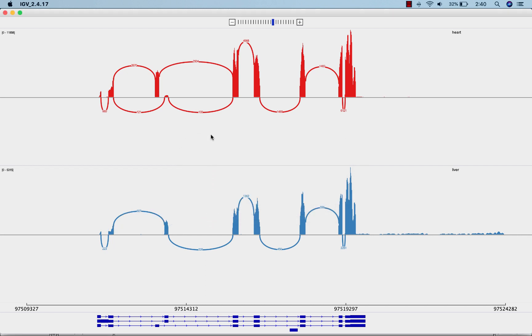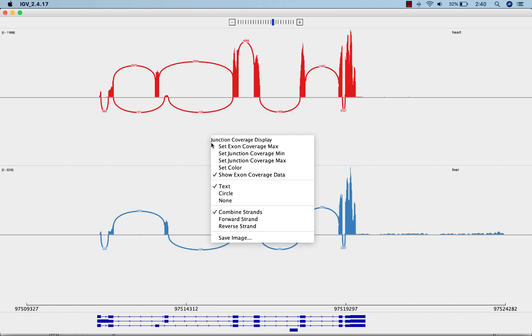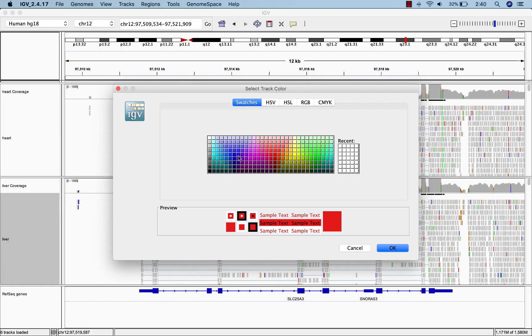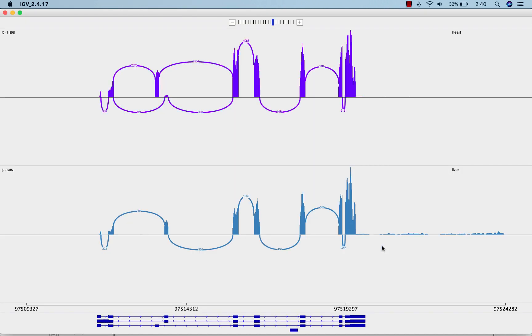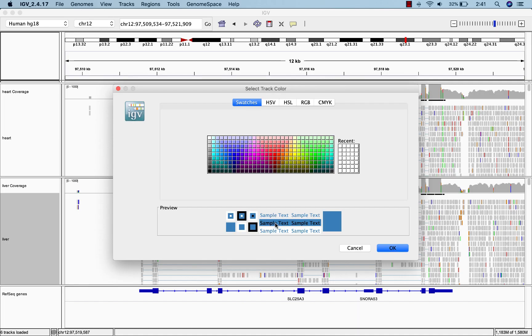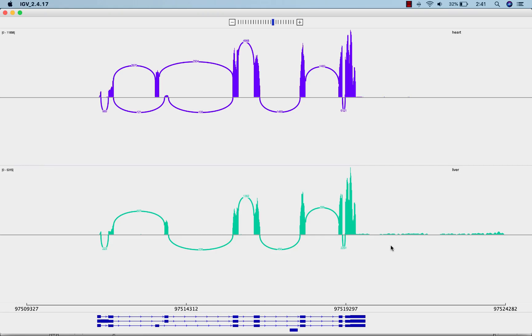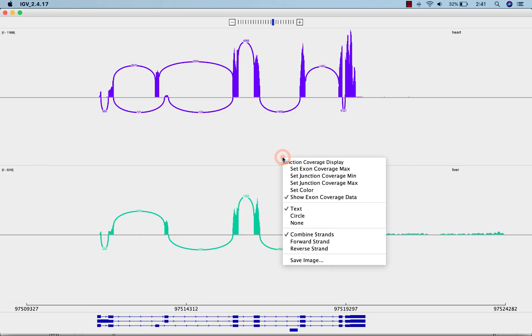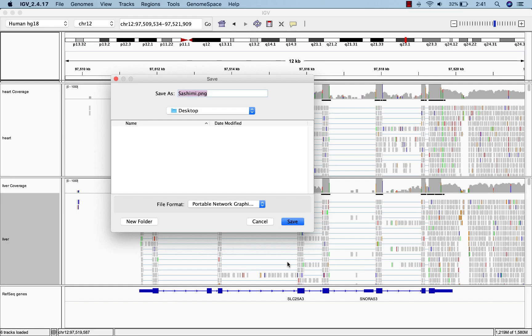When you're happy with your sashimi plot, you can change the color of the tracks as a final touch. And if you right-click and select save image, you can share the plot with others.